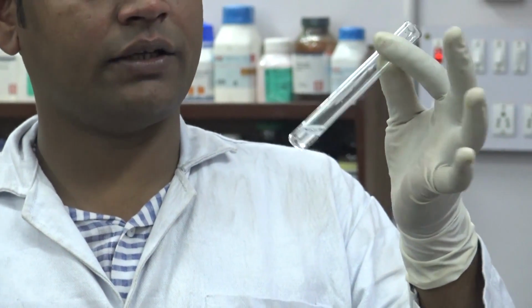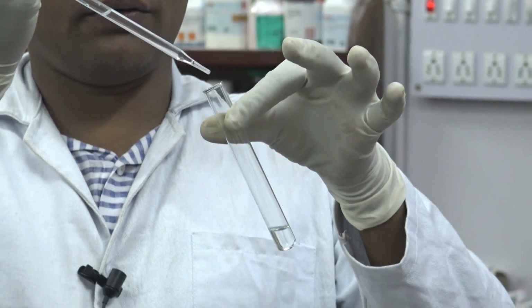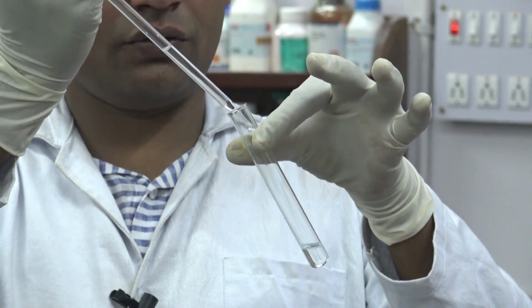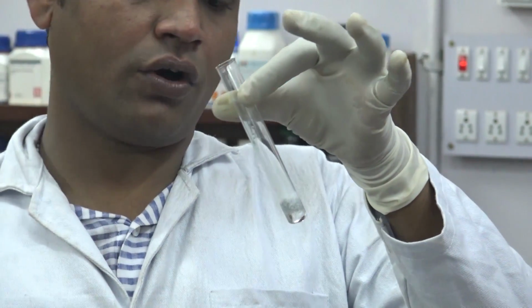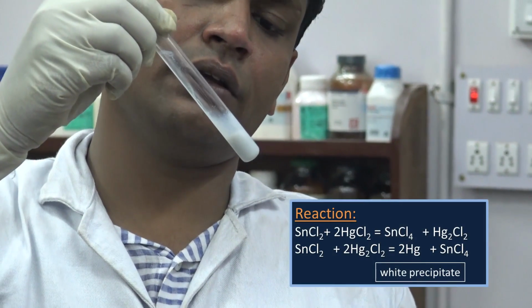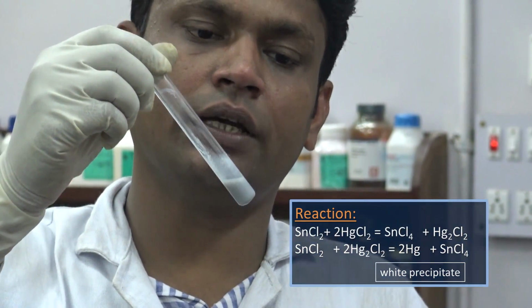After acidifying the reaction solution, add 0.2 molar HgCl2 solution to it. White or grey-white precipitate confirms the presence of Sn+2 in our solution.